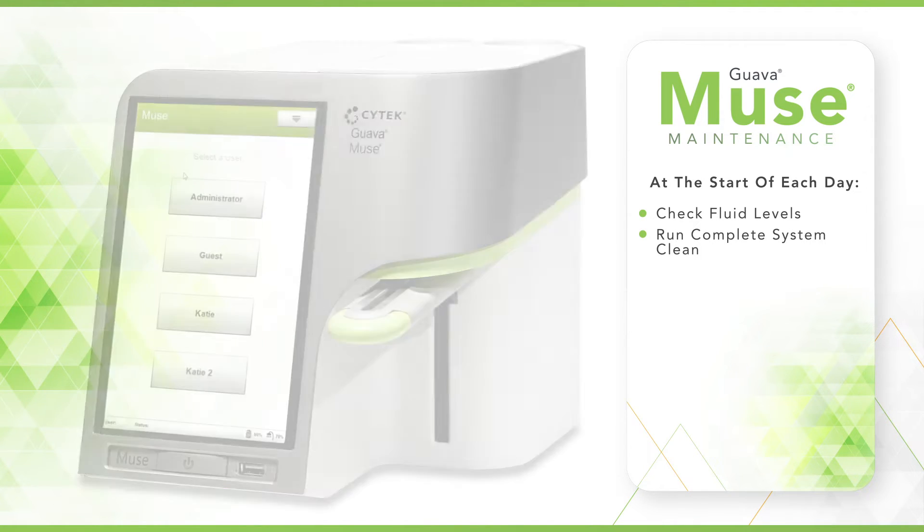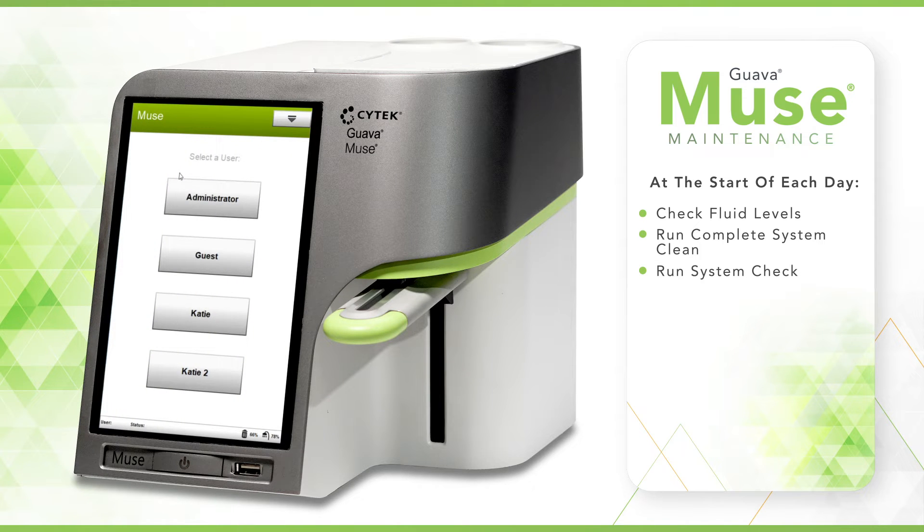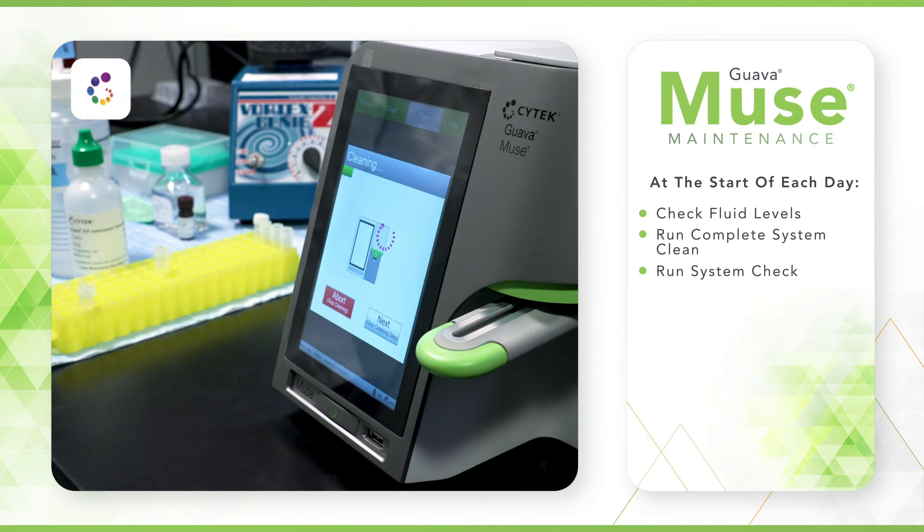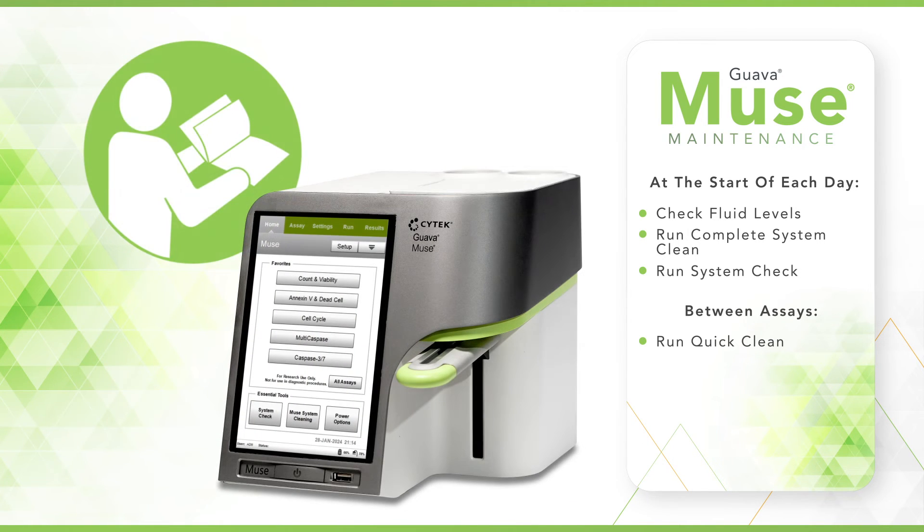Once the cleaning module is complete, it is recommended to run a system check before performing any assays. If you are running multiple different assays during the day, we recommend a cleaning cycle in between assays. Consult the Assay User's Guide for specific cleaning instructions, as this may vary between different assays.